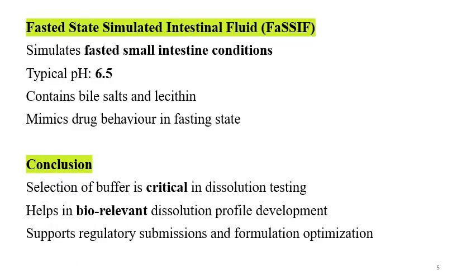Then fasted state simulated intestinal fluid, FaSSIF. It simulates fasted small intestine condition. It has a typical pH of 6.5. It contains bile salts and lecithin. It mimics drug behavior in the fasting state intestinal environment. These are the various buffers used for the dissolution testing.